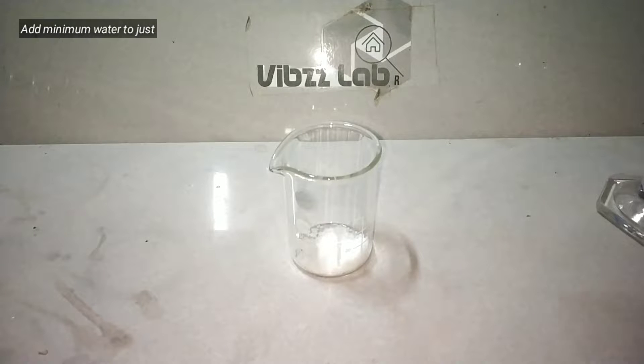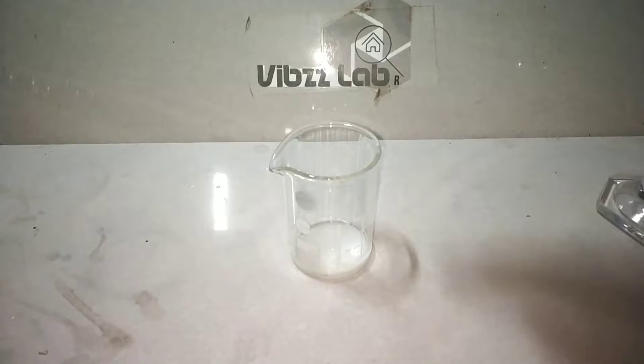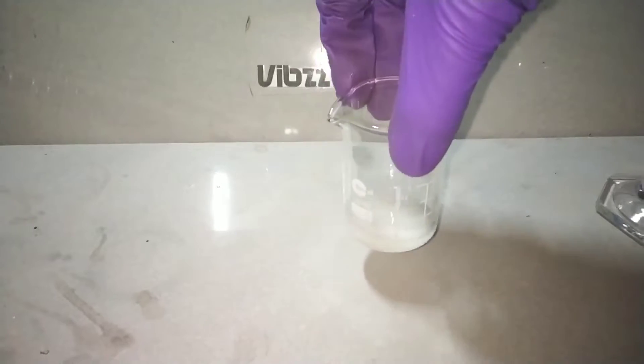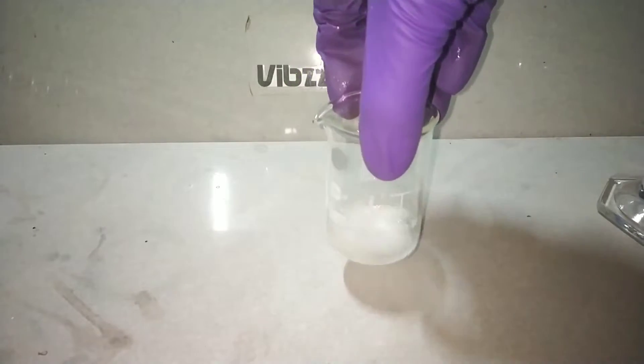A very minimal amount of distilled water is then used to dissolve the potassium iodide salt completely. This will take place very fast as the solubility of potassium iodide in water is very high.